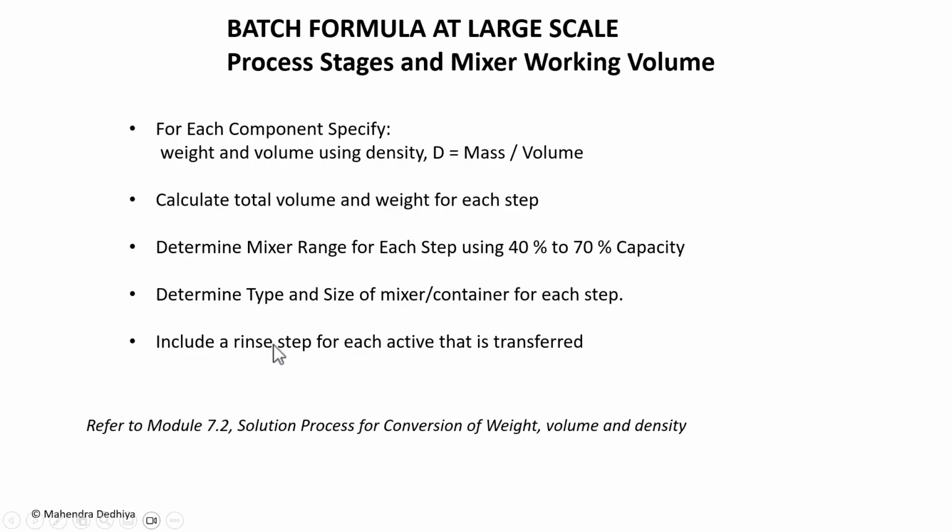Include a rinse step for each active that's transferred. This will minimize the loss of active.